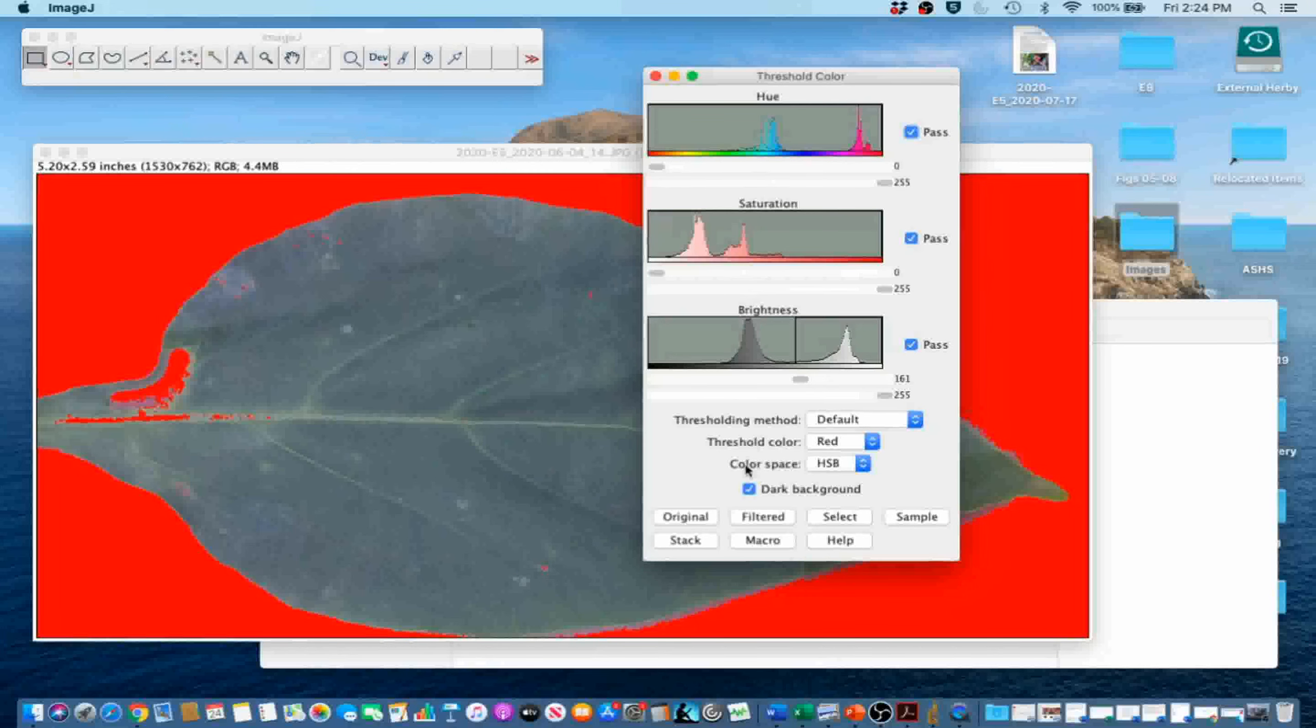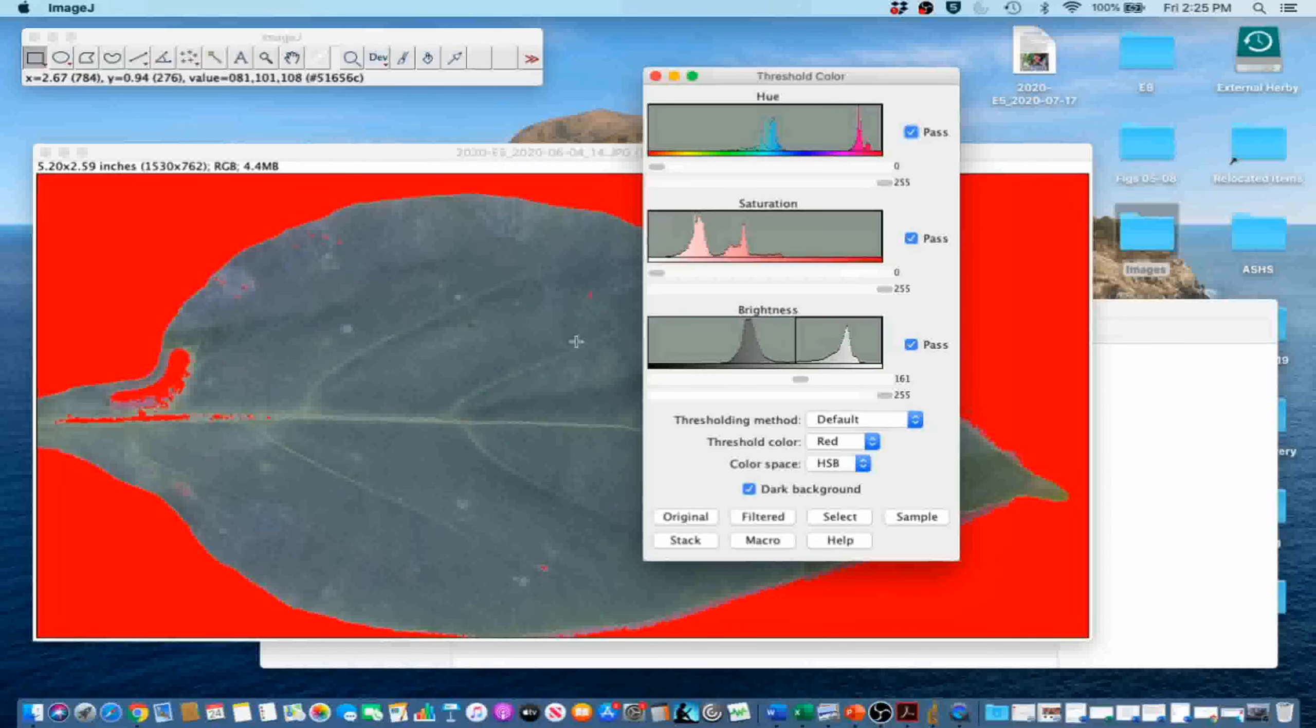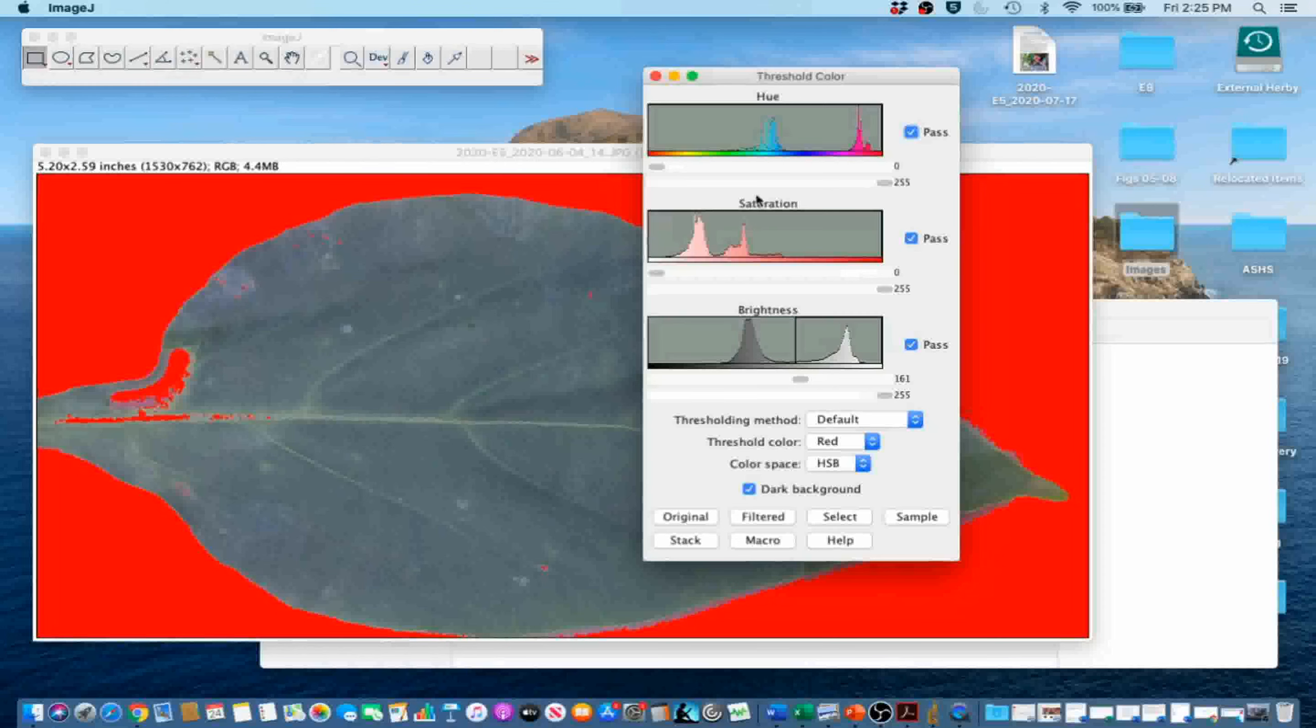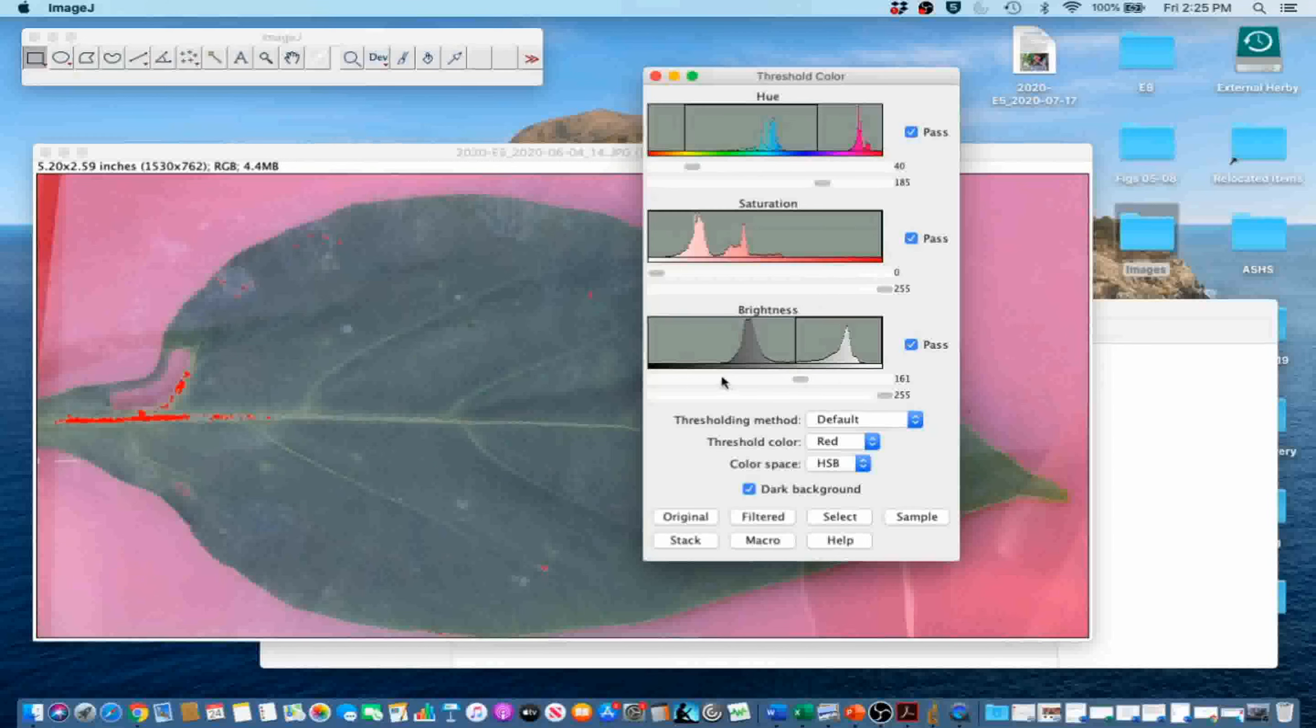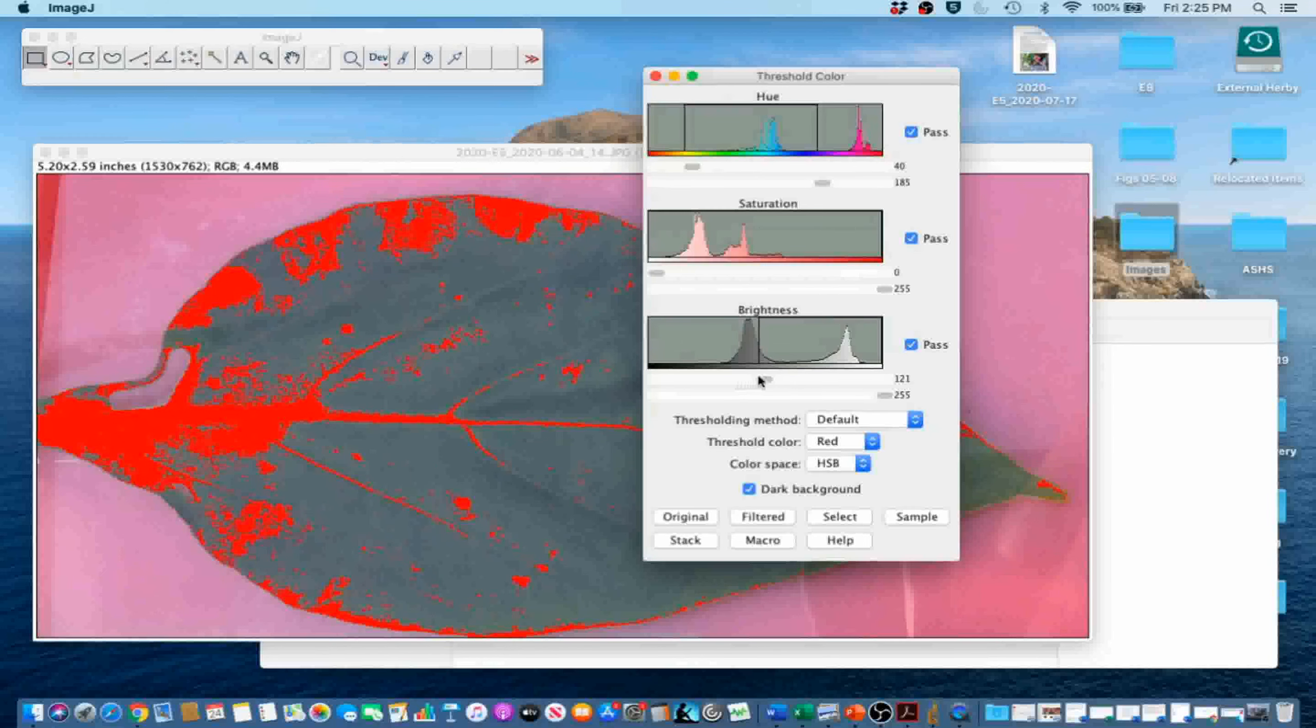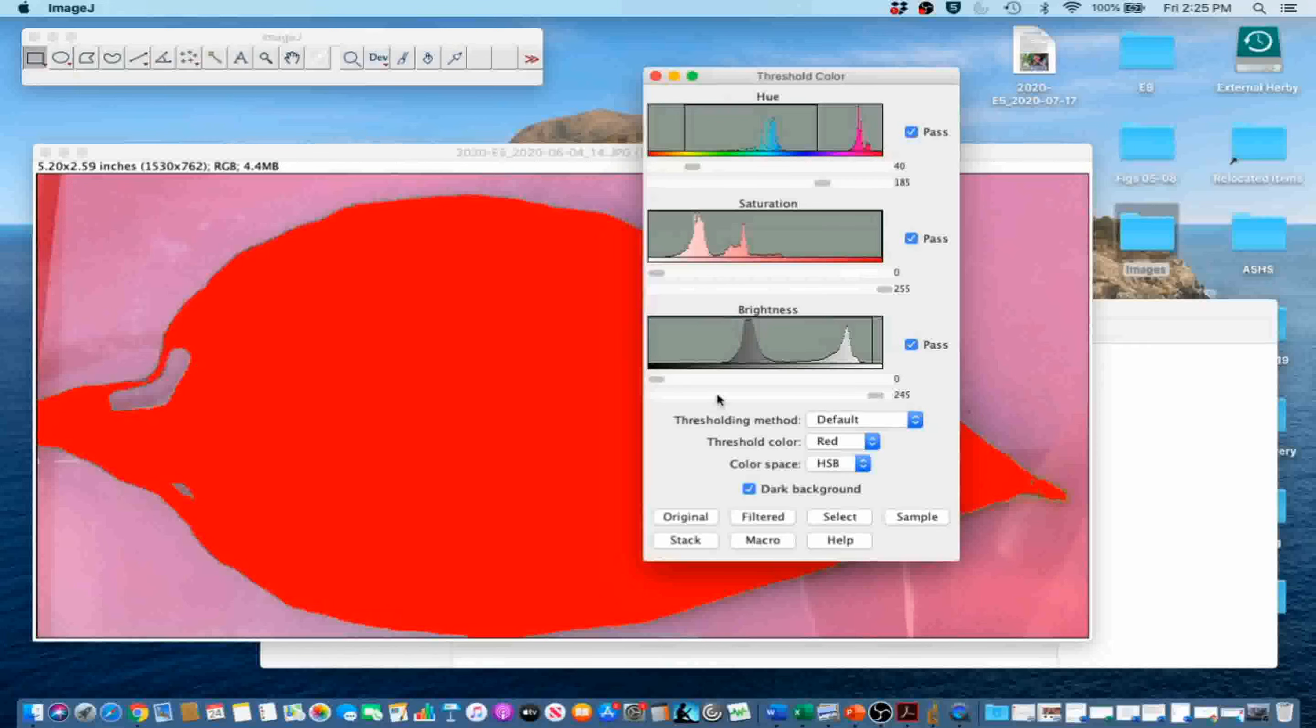Hue is one of the color appearance parameters and it describes pure spectrum colors. Since red is green's complementary color and the clipboard is red, the clipboard should be relatively easy to separate from the leaf tissue. In this case, hue range from 40 to 185, saturation from 0 to 255, and brightness from 0 to 175 should work well.